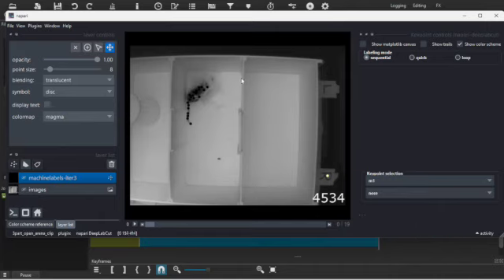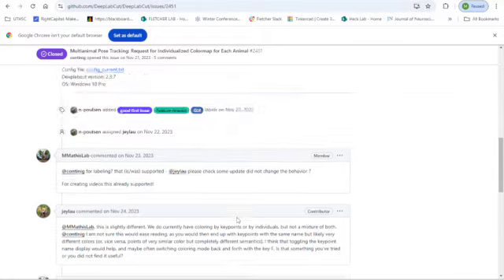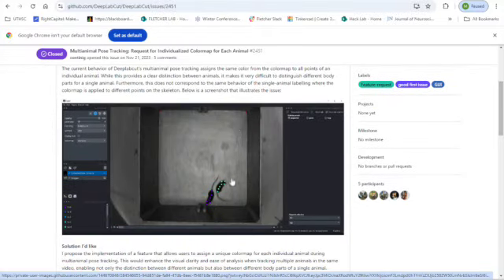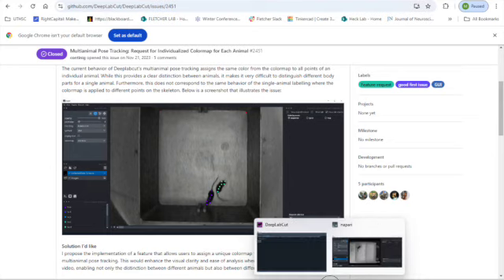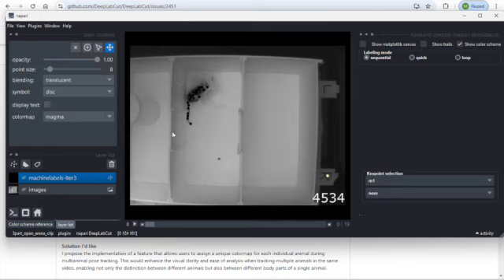Okay, so this is labeling the animal with all the same points. So with multi-animal projects, as you can see here, if there were 2 animals, it would label animal 1 with all blue points and animal 2 with all purple points. But it doesn't label them across a color map for each animal, which makes it challenging to distinguish the points of each animal. So if this is happening to you, you just press the key F, nothing else, and then it will toggle to making each body part a different color in the color map.